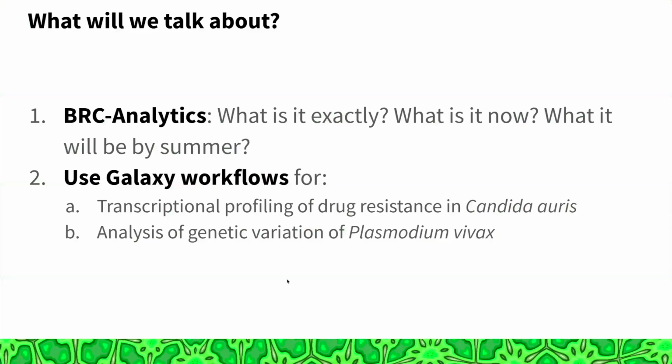So today I divided this into three parts. I'm going to remind everybody what BRC Analytics is, why it exists, what it's going to do, and in general where we're going. Then I'm going to highlight two kinds of analysis that you can do with workflows within this framework.